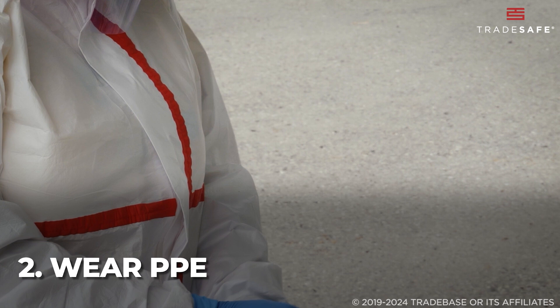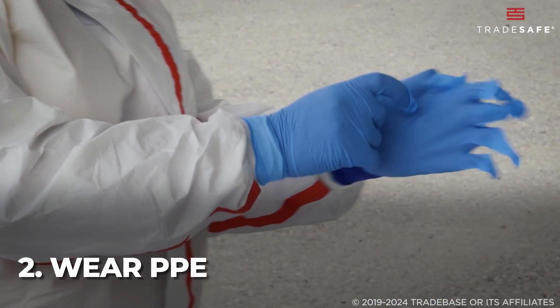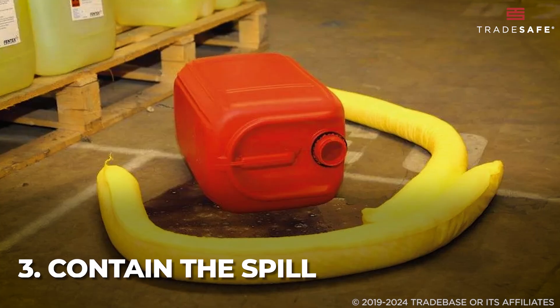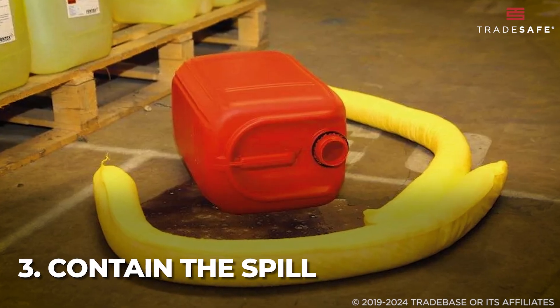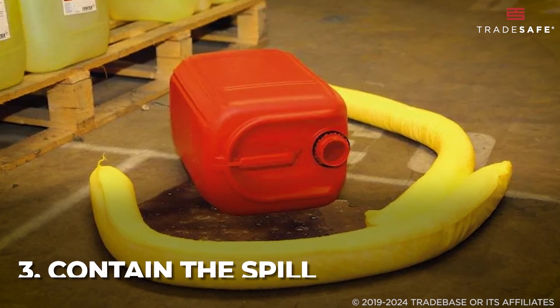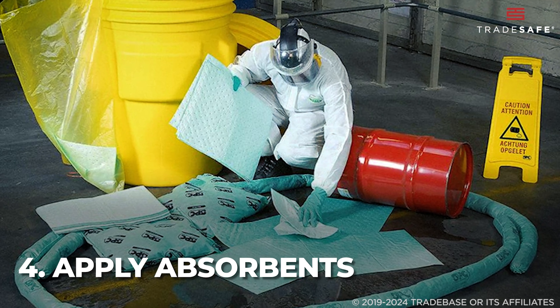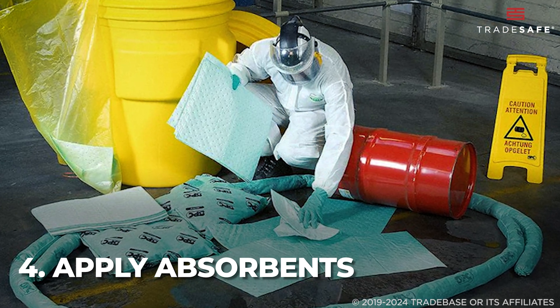Make sure to wear PPE. Put on the provided gloves, goggles, and any other necessary protective gear. Contain the spill using booms or barriers to prevent the spill from spreading further. Then apply absorbents — place pads, socks, or pillows on and around the spill area.